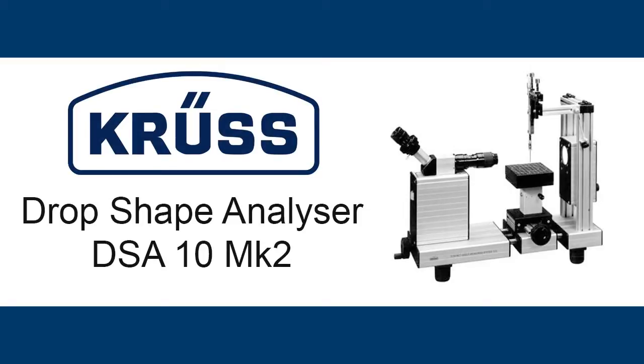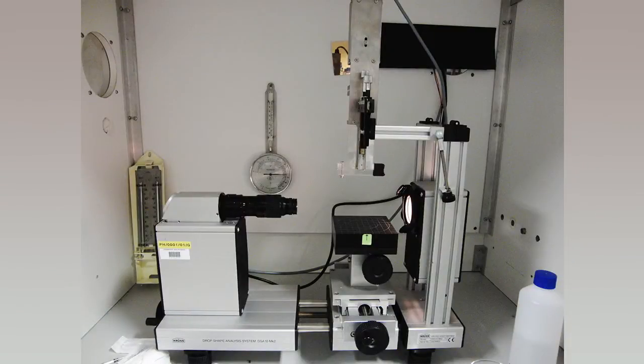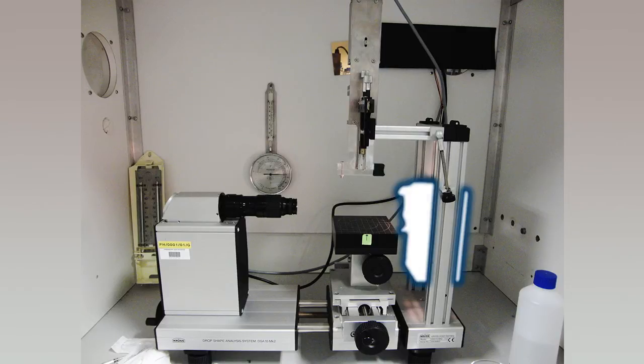This video will discuss the use of the CRUSD DSA 10 Mk2. The DSA has four main components: the camera, the stage, the syringe control mechanism, and the backlight.